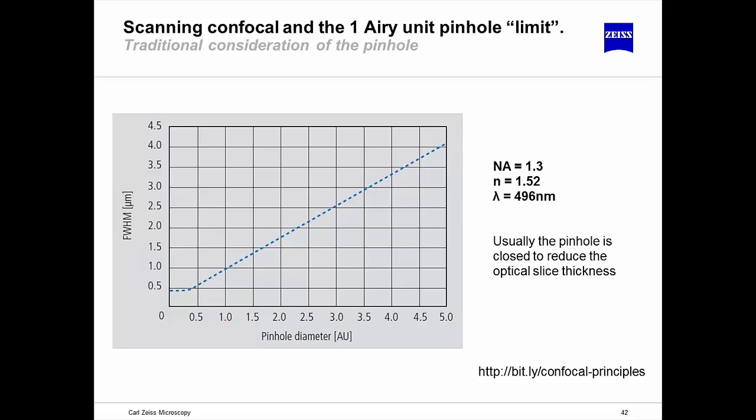The next few slides I'm going to show you come from what we call the Confocal Principles book. This is a PDF that we make available from Zeiss. There is a bit.ly link in the bottom right-hand corner to take you directly to the PDF. This document that we've published for decades now has a number of graphs which, when you look very closely at them, it reveals how we can squeeze more information out of the confocal.